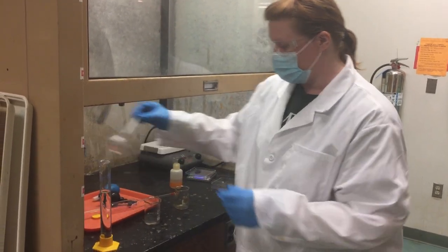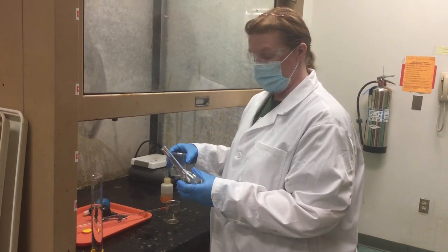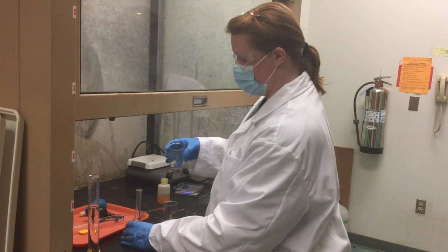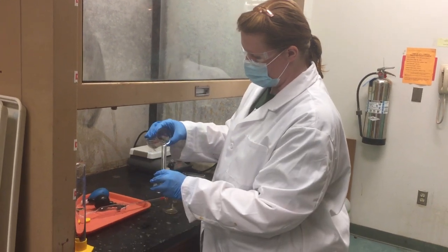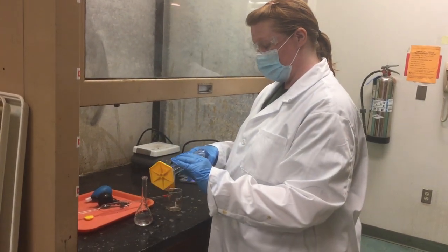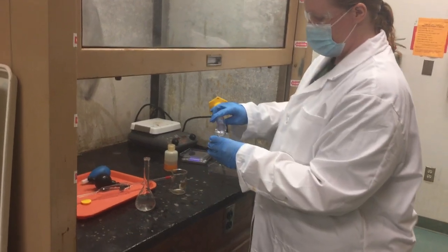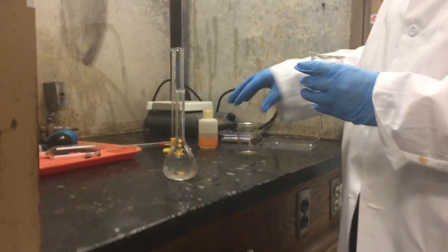Now I'm ready to use my volumetric flask, which I would have cleaned carefully and rinsed with deionized water — there's no need to dry it because you're going to dilute anyway. The proper way to dilute is to put the solution into the flask, then rinse your beaker a few times. This ensures that all of the material you carefully weighed out is included in your flask. About two or three rinses is good.